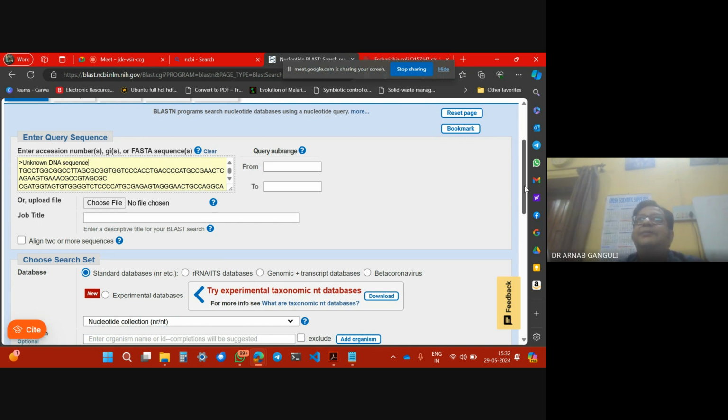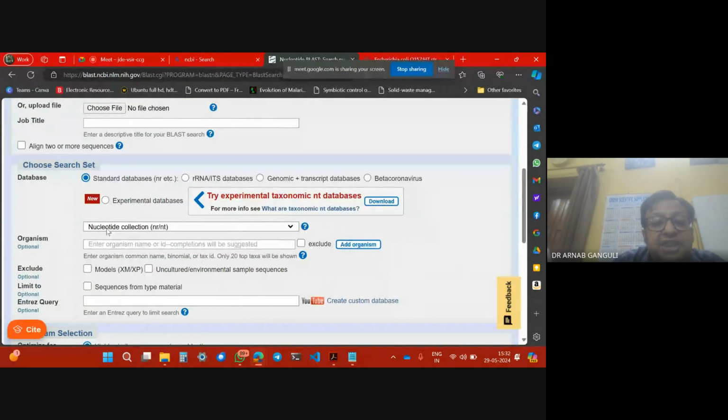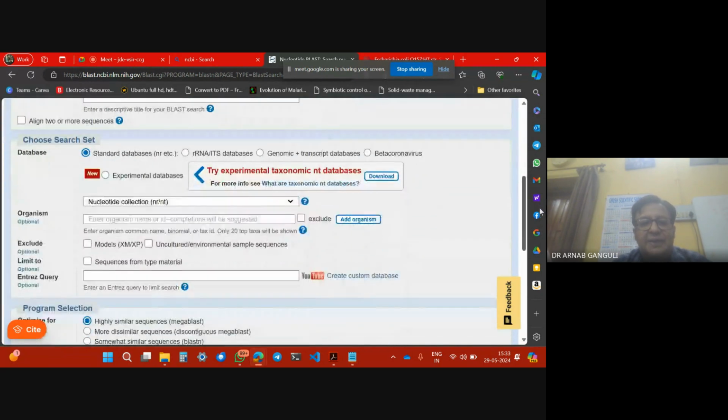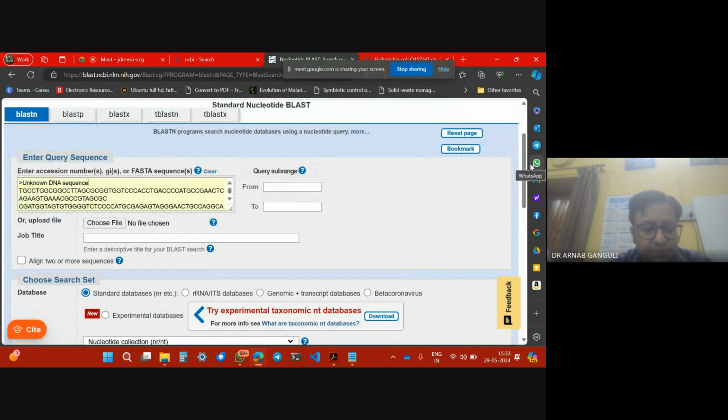So right now we can expect the time, it's 15:30. We are still in the daytime. So in America, it's early morning right now. America is sleeping, so maybe we can find it to be faster. Let us see. So we have checked it out, it's a nucleotide collection. Okay, so I've taken a screenshot, right? So now I've pasted it. This is the general blast which I'm showing.